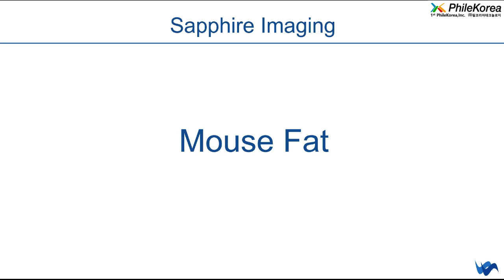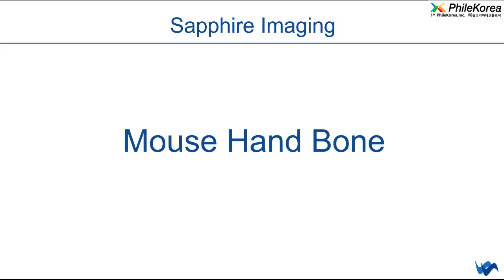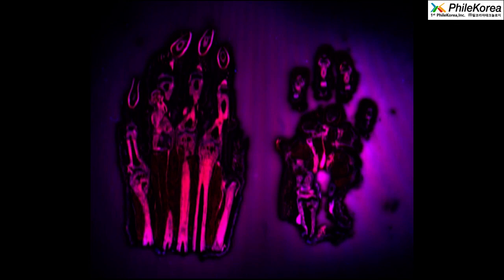Right. Now I would like to show you some mouse fat. So this is mouse fat on the glass surface. And here you can see a mouse hand bone. So we also had an experiment: a mouse hand, a healthy one and a diseased one on the right side. I can show you this also in fluorescence, in color.